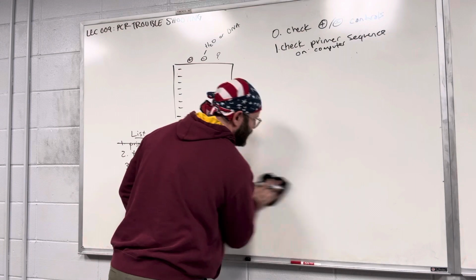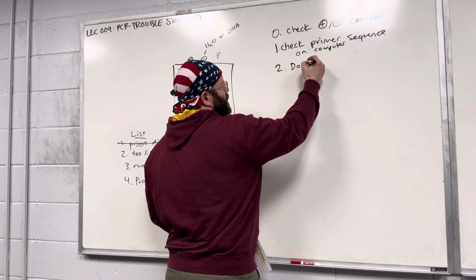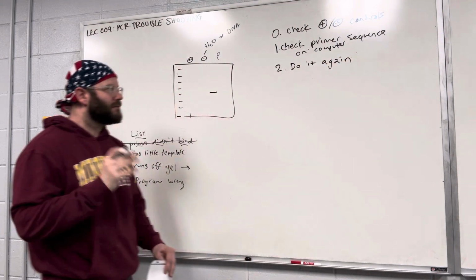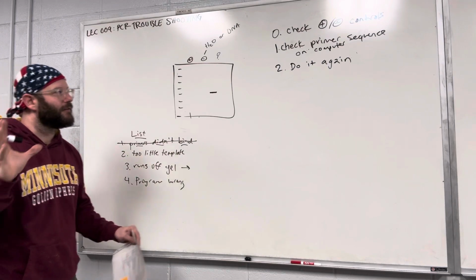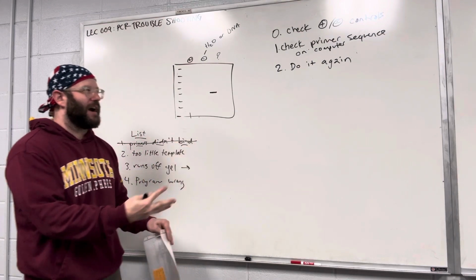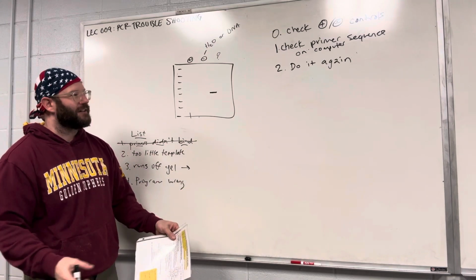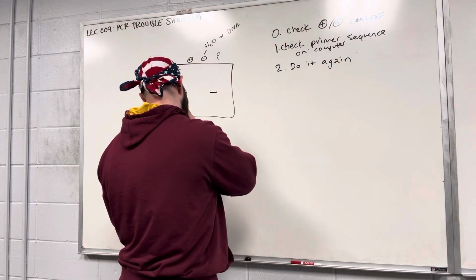Okay. Then I would, to do what Alex said, I would just do it again. Do it again, see if you see the same result. Usually, sometimes if you just do it again, things miraculously fix. Has that been your experience? Yeah, definitely. Molecular biology is very kind of religious like that. You try something and you fail, and sometimes if you just keep trying, it just works. Okay.